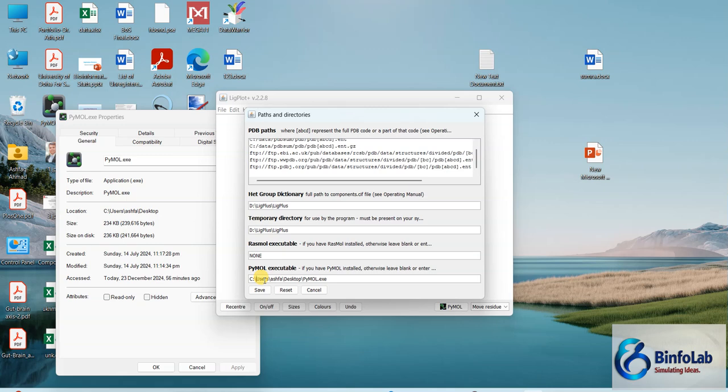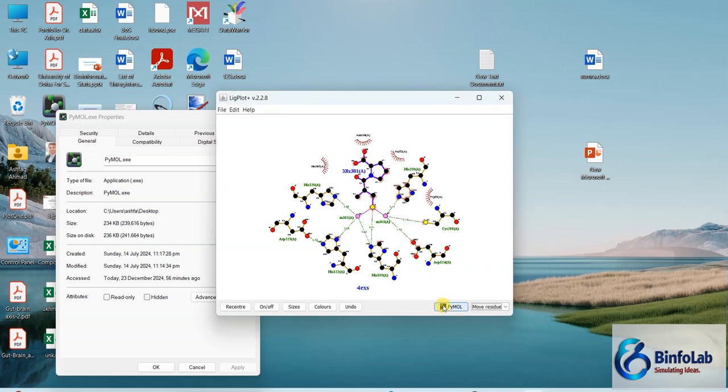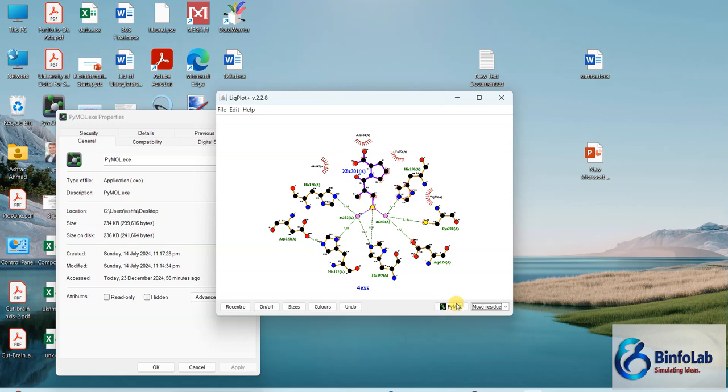I think it should be like this, /, or we have to restart this program again. If it doesn't work this time again, let me restart this program. I'm going to pause this and will show you how I solve this problem.